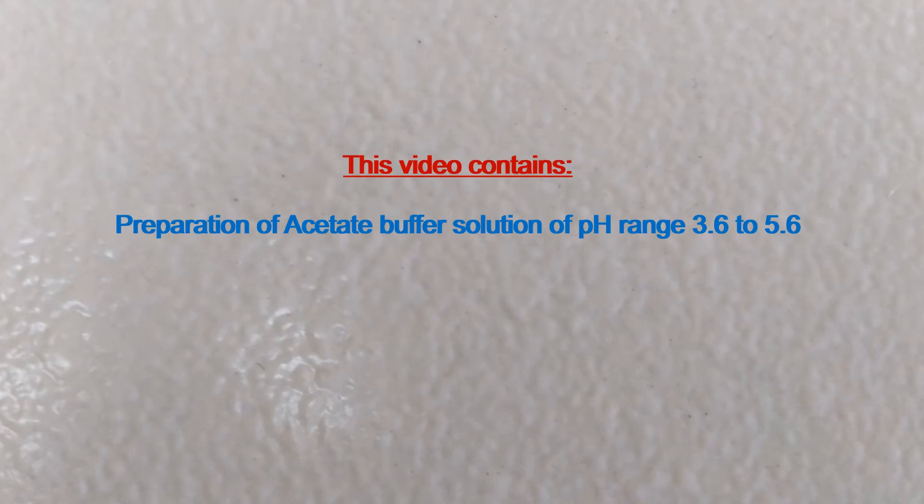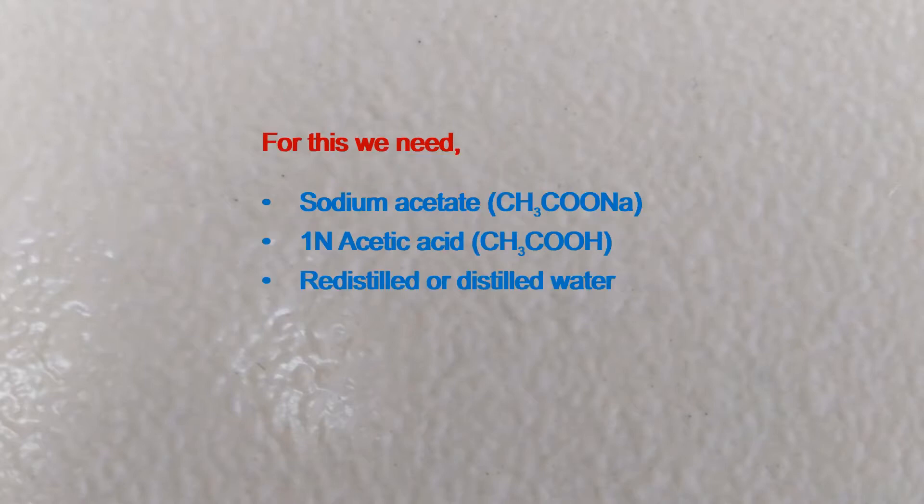This video contains preparation of acetate buffer solution of pH range 3.6 to 5.6. For this, we need Sodium Acetate, 1N Acetic Acid, and Redistilled or Distilled Water.